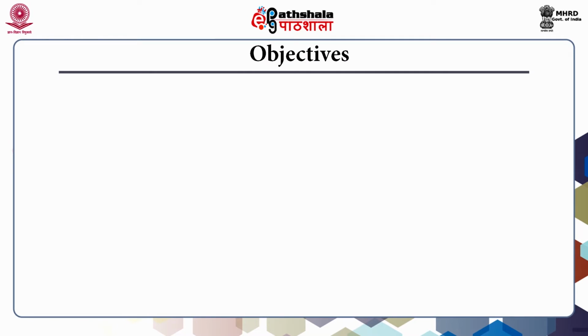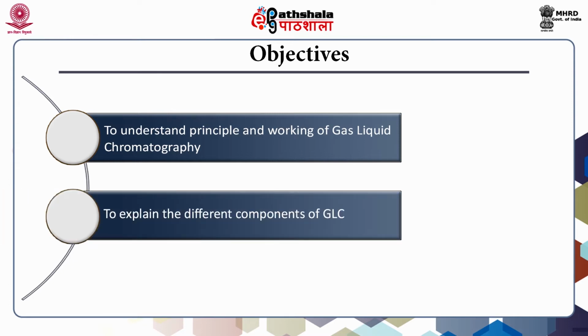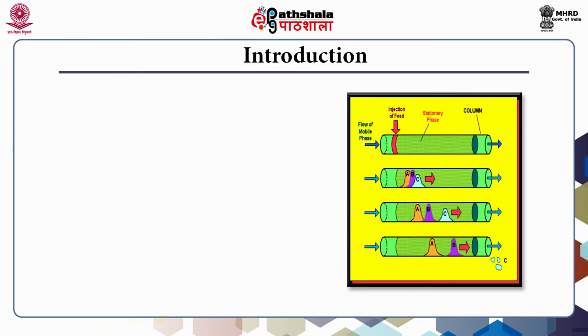During my lecture, I will be telling you about the basic principle of gas liquid chromatography, then the components involved in gas liquid chromatography, a little bit about its application, and then its working. Thank you. So, let us have the introduction, and see what gas liquid chromatography is.